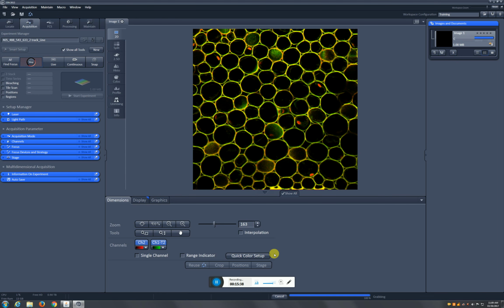So I think it's a useful feature because it doesn't always get it configured right, but it usually gets you in the ballpark of what your configuration should look like. Now I'm gonna go through and show you how to configure it manually and tweak your image quality a bit. So the image quality is not bad.